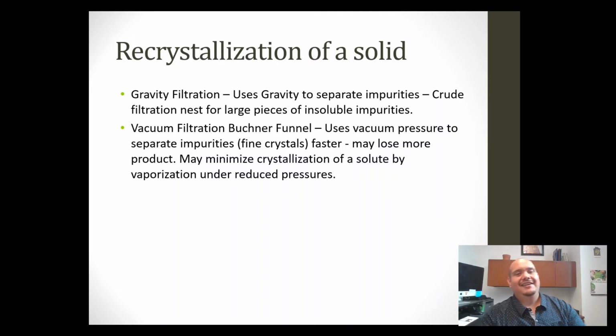Recrystallization of a solid. You can have 2 means to remove a solvent from a solute: gravity filtration and vacuum filtration. And you might have to use both, or you might just use one or the other.